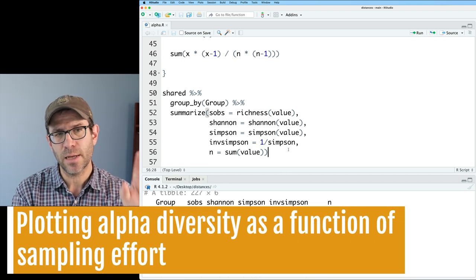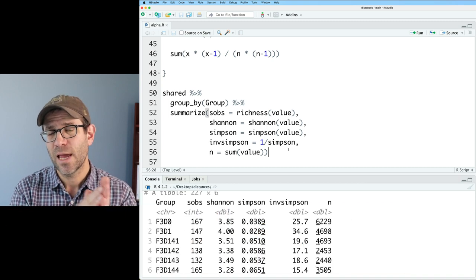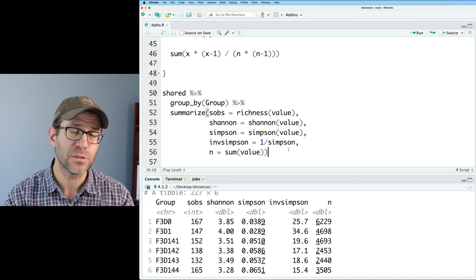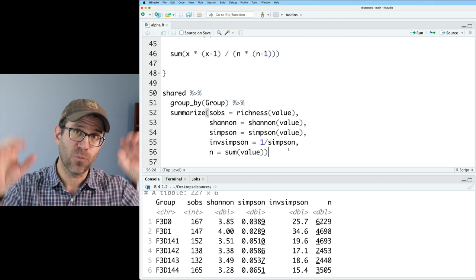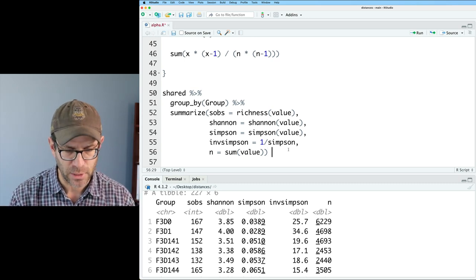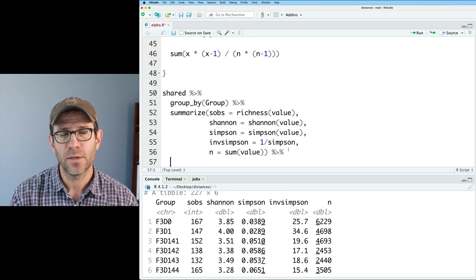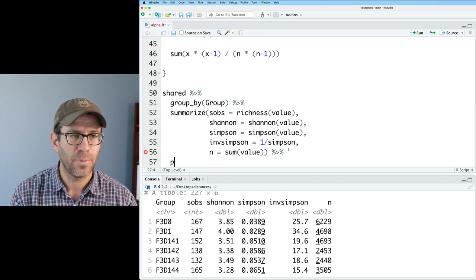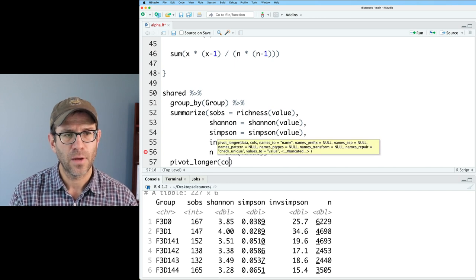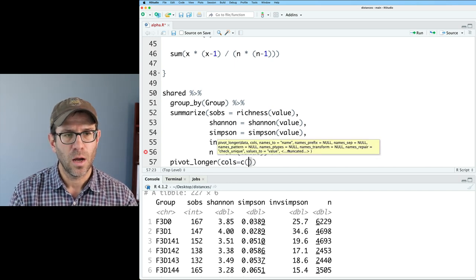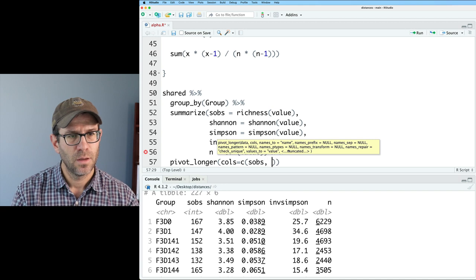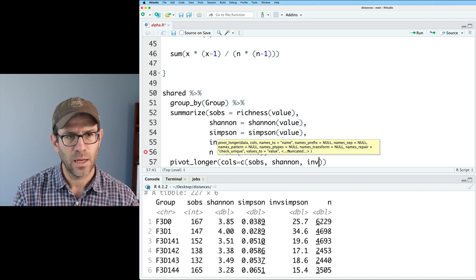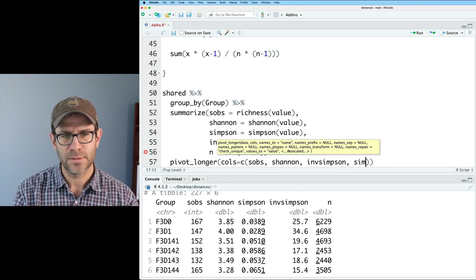So let's go ahead and plot these data. What I'd like to do is plot the four diversity metrics as a function of the number of individuals. And as we've seen before, I'd like to have four facets for each of the metrics. And so to do this, we can of course do a pivot longer. And the columns that we're going to pivot longer will be Sobs, Shannon, INV Simpson, and Simpson.